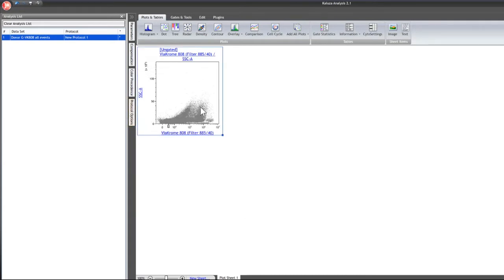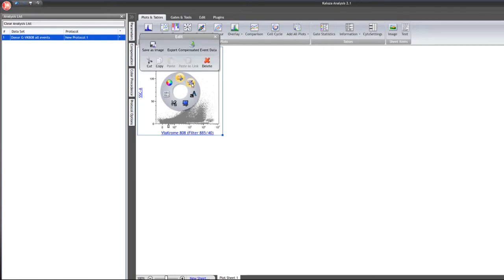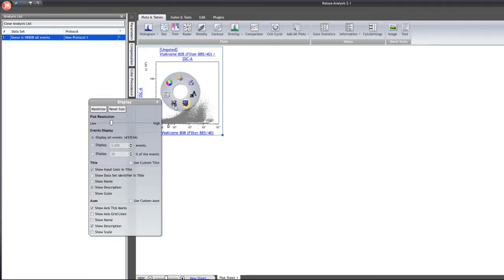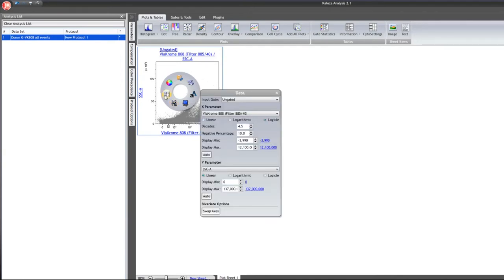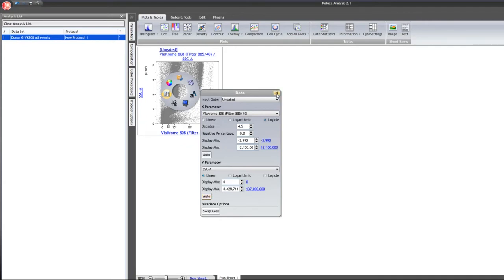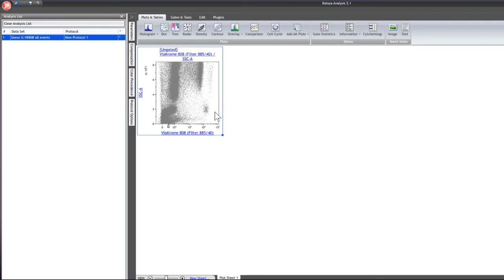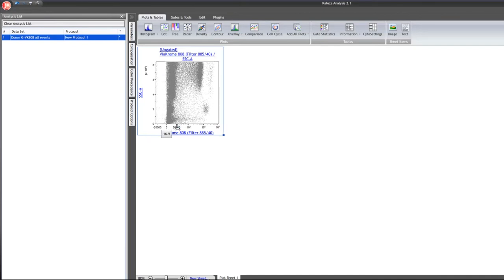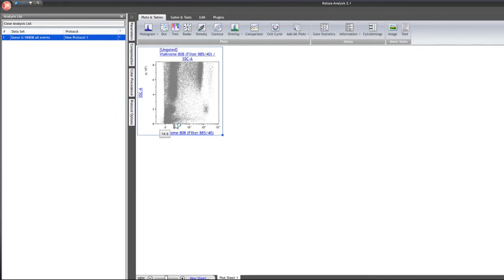If you want to scale the plot differently, right-click on a plot to bring up the radial menu, which gives you various options to adjust. Selecting the data window lets you adjust X and Y parameter scalings. For the Y parameter — side scatter — you can manually adjust the minimum and maximum of the range, or click auto to let the software auto-scale. For the live dead cell marker with logical scaling, you can use the logical scaling bar to adjust the bi-exponential transition point very easily, making it a fast and unique way to scale data.